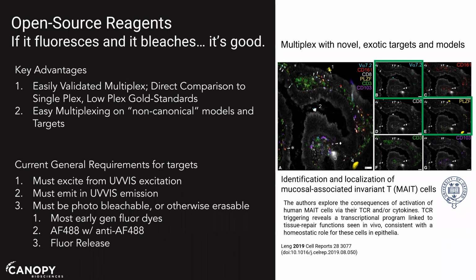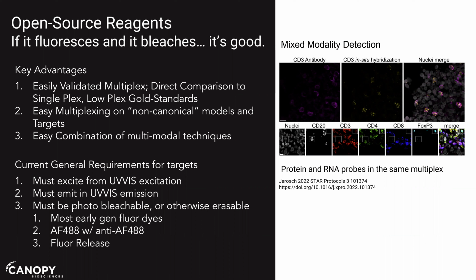I wouldn't expect them to have PLZF. That would be a custom conjugation project, which may or may not fail and is at least going to eat up a bunch of resources. So we can obviate that, which is pretty cool. The last thing, kind of forward thinking, is again, anything that fluoresces is something that we can use.